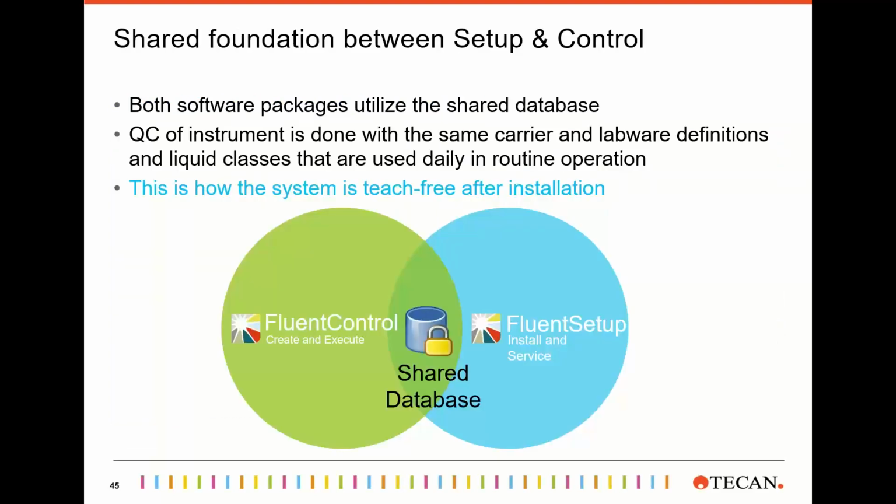And then maybe this is quite nice to mention as well, that there is a shared database that is used by both the Fluent setup software, so used by the engineers in the field to set up the instrument and do QC, and Fluent Control itself. And this is actually why the system is teach-free after installation.